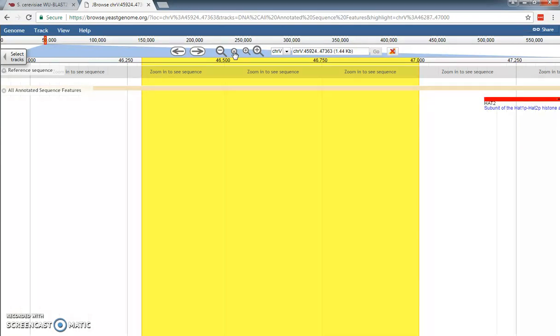The reason that it's important to be able to keep track of it is that that region is the part of the yeast genome that matches the sequence from our SnapGene file. In other words, this is the piece of the yeast genome that we managed to sequence, and it's one end of the insert in that particular recombinant plasmid.